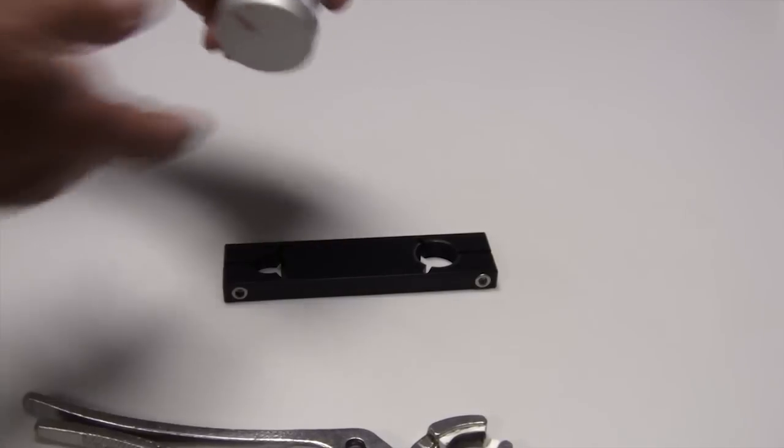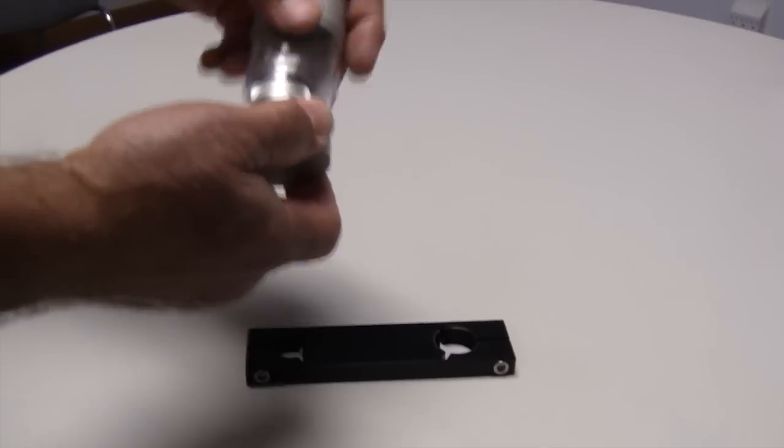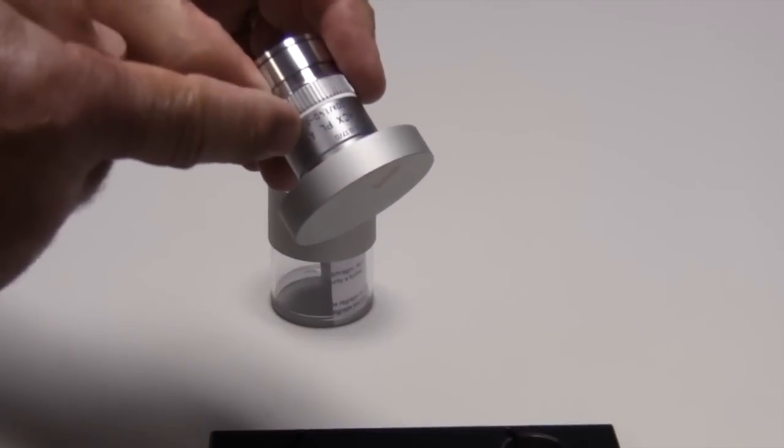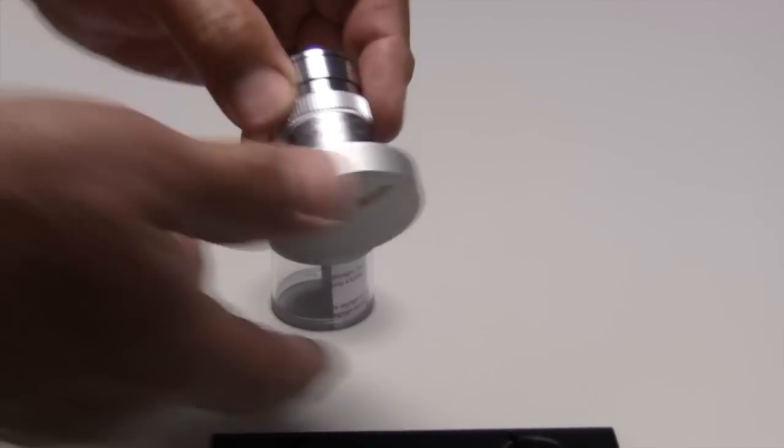Here we're going to go over removing the sleeve off of a Leica objective. This is the sleeve that has the writing on it that tells you the magnification and NA of the objective.